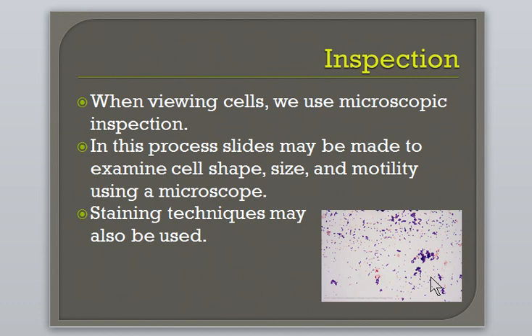This specimen has been prepared using a gram staining technique. As you can see, we have 2 distinct bacteria, one which is spherical in shape and stains purple, the other which is rod shaped and stains pink. One can use the information to help determine if the sample needs to be further isolated, as well as learn more about the identity of the 2 bacteria.